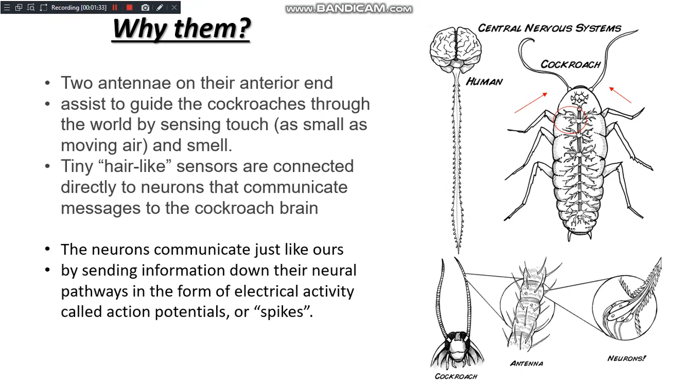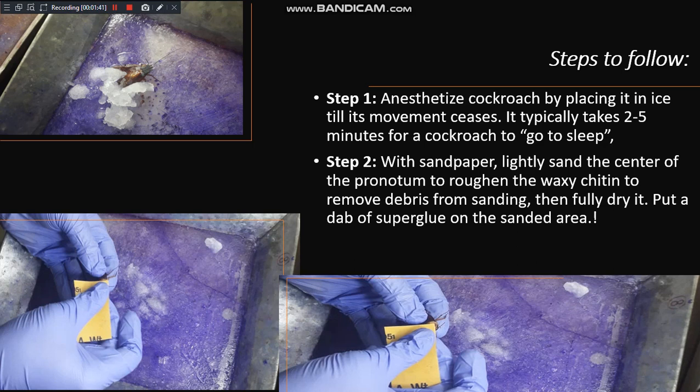It is easier to provide micro-stimulation by external means. The steps to follow: first, anesthetize the cockroach by putting it in ice water until its movement ceases. Because it is cold-blooded, it cannot bear much temperature change and gets into an anesthetized or unconscious state.